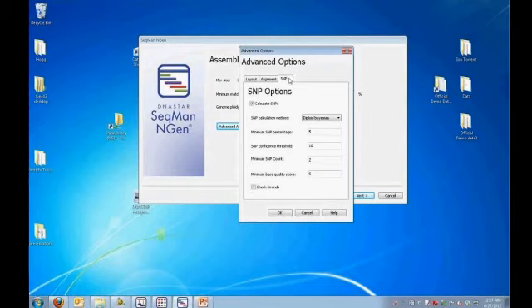There's also some advanced SNP options, so we can see that we're doing a diploid Bayesian method here. We're calculating SNPs by default. And then there's some filtering that occurs. Again, for these large data sets, exomes and whole genomes, there's a fair amount of sequencing noise. In fact, it can be sequencing errors that occur at very low percentages that you want to remove from your SNP analysis.